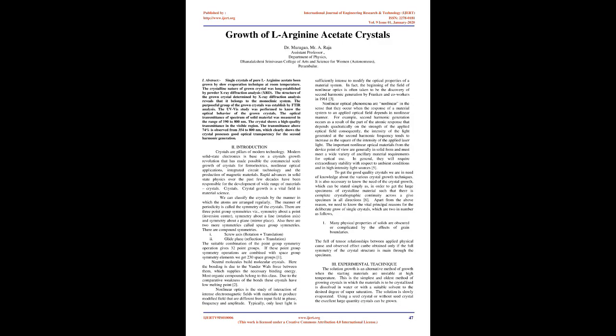Growth of L-Arginine acetate crystals. Abstract: Single crystals of pure L-Arginine acetate have been grown by the slow evaporation technique at room temperature. The crystalline nature of the grown crystal was confirmed by powder X-ray diffraction analysis, XRD. The structure of the grown crystal, determined by X-ray diffraction analysis, reveals that it belongs to the monoclinic system.